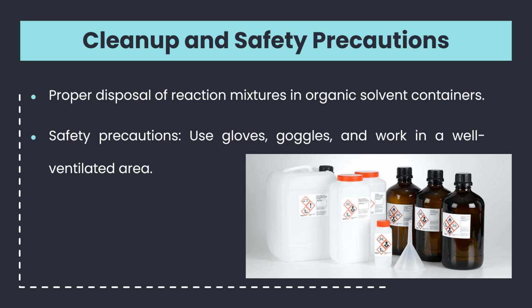After completing the experiment, we must ensure proper cleanup. All reaction mixtures should be disposed of in designated organic solvent containers to prevent environmental contamination. And also, safety precautions are paramount. Always wear gloves and goggles and conduct the experiment in a well-ventilated area to minimize exposure to harmful vapors.